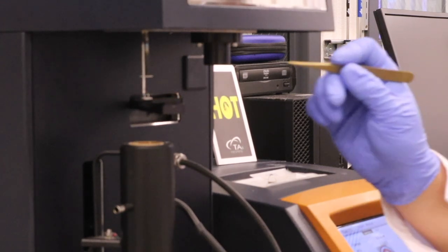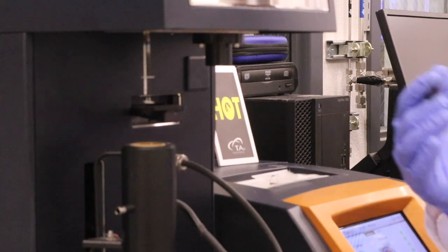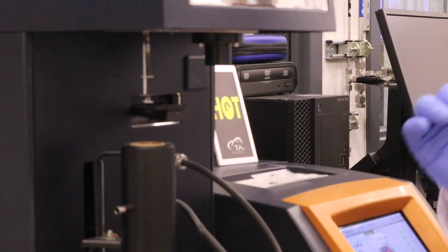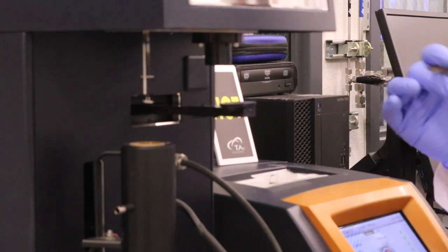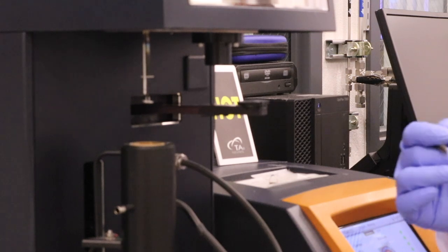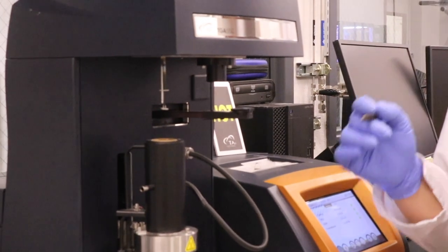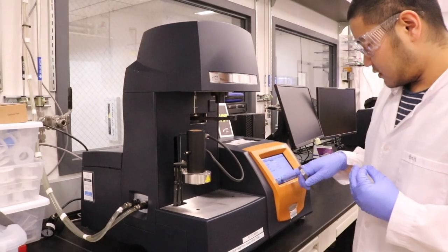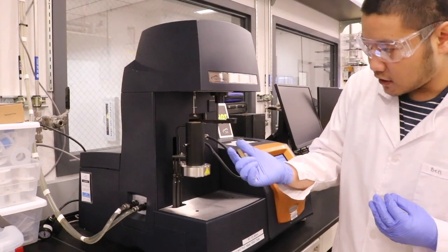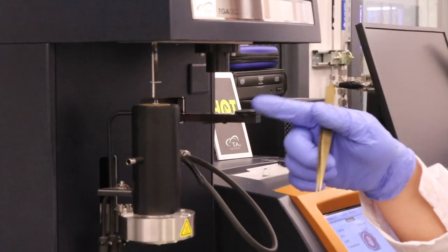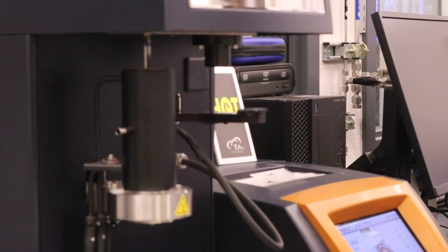So how this machine works is it will increase the temperature of this sample up to 1,000 degrees Celsius. And at the same time, it will measure any weight difference. So if you have a material of one polymer and one metal at different temperatures, at a lower temperature the polymer will first degrade and then the weight you measured will be the amount of metals you have. In that way, we will know the exact composition of this sample. Right now we will close the furnace here and then fill the chamber with nitrogen and start our experiment up to 1,000 degrees.